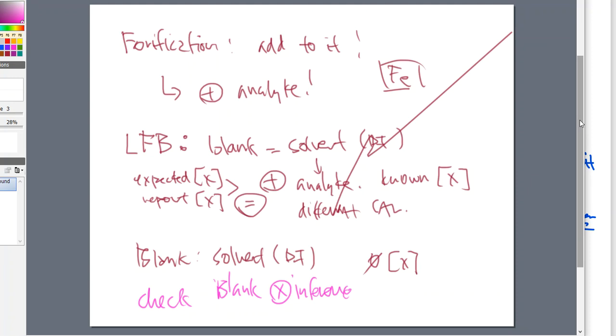We also, again, want that concentration to be different than the calibration standards that we've made for our linear regression curve. We want these to be different. We don't want them to be the same. So preferably the SOPs will make you go down that rabbit hole of coming up with a concentration that doesn't quite match a standard.